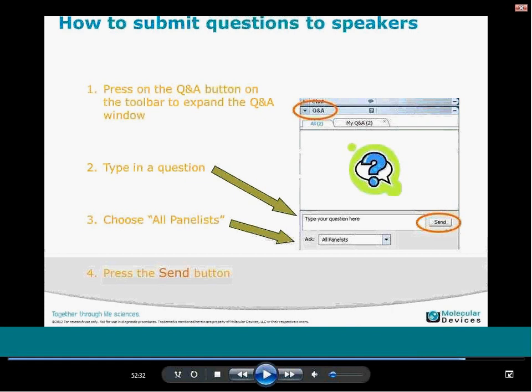How does filter mask work? Filter mask is a feature that Paula used in the last example, the platelet assay. Filter mask works a little bit in the same way that IMA would work, for those of you that have used it in the past. You can filter out artifacts or different intensities of interest out of your image to make measurements of what's interesting.